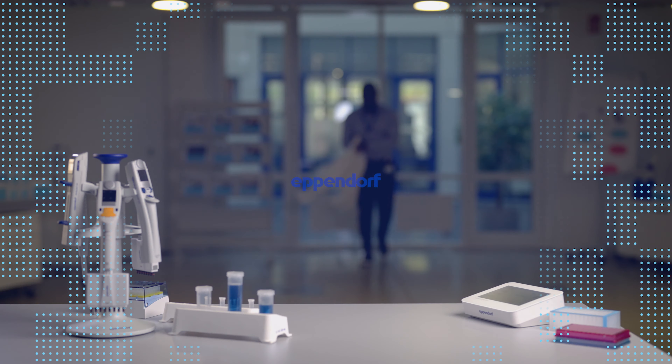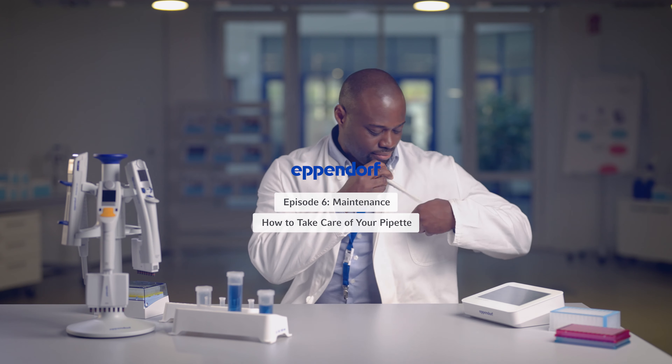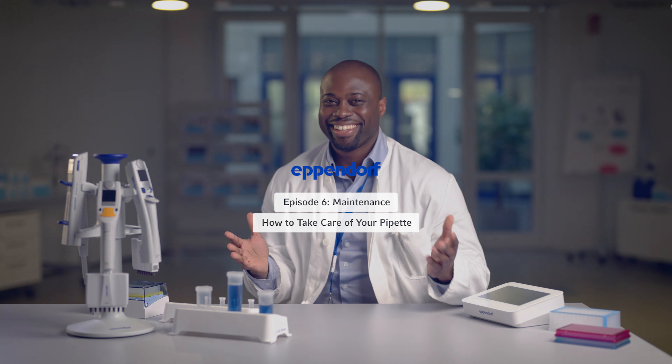After a long day of pipetting, there's still one more task to do. Pipets are precision instruments that require good care for consistent results. Hi, I'm Fred and in this part of our video series on liquid handling, we'll talk about pipet maintenance.